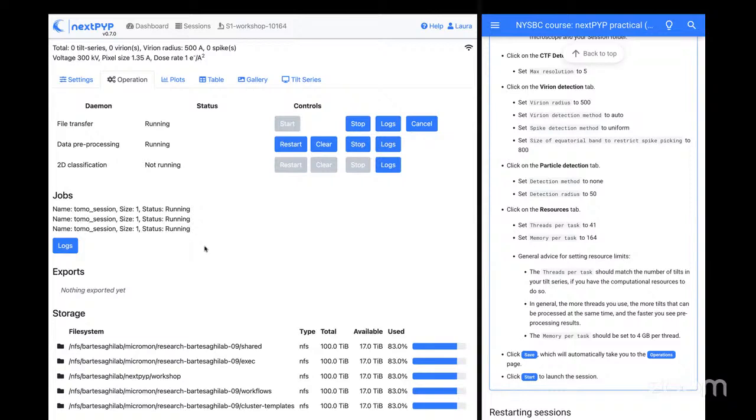That might be your setup, because your P3 image servers have SSDs. Yeah, your 9 terabytes of SSD. That's as fast as you can get for storage. So what's your pipe out? Is it copper or fiber? Fiber. Fiber should go at the speed of light, so it should be very fast.